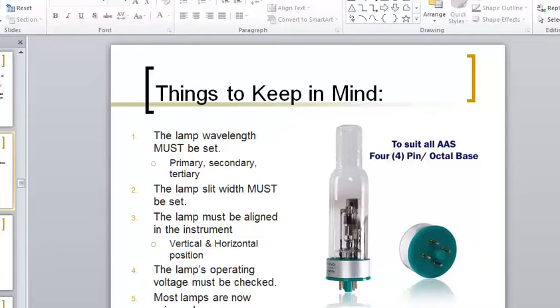And the reason we're going to hold off on this is because it's directly related to concentration work and calibration curve work. And that's when we'll talk about it. So, primary, secondary, tertiary, you do not know now. You don't understand the difference of it. That's okay. I don't want you to know the differences of them, but you've got to choose the proper wavelength overall.